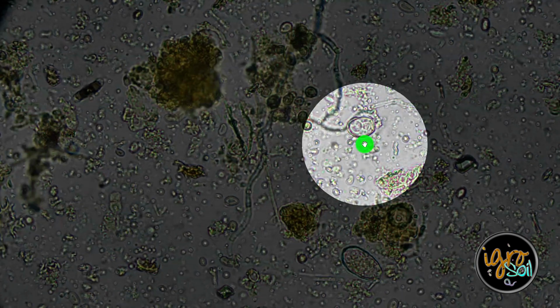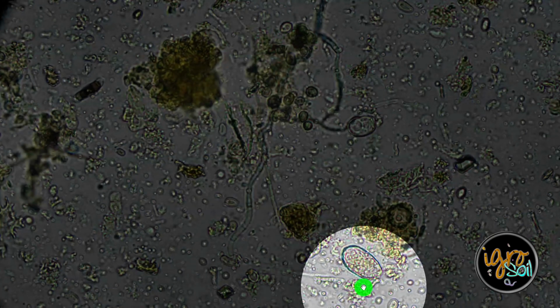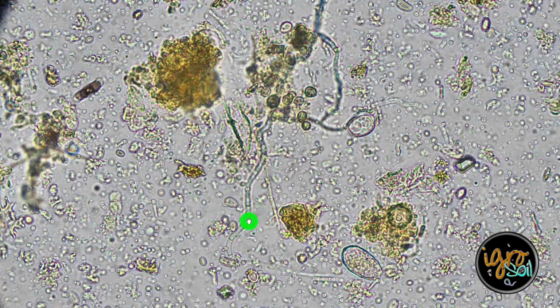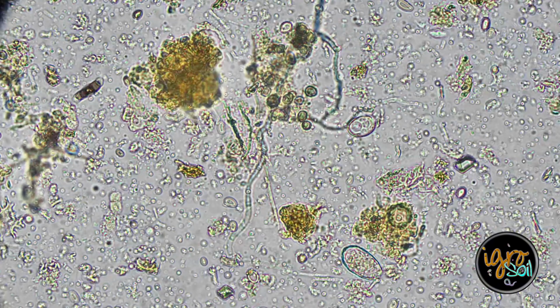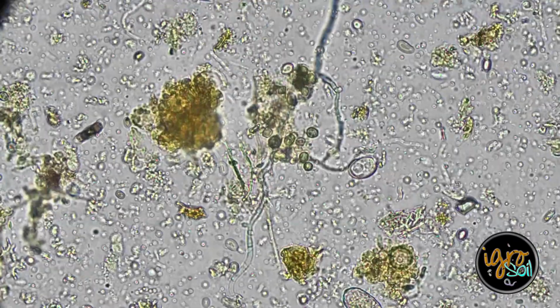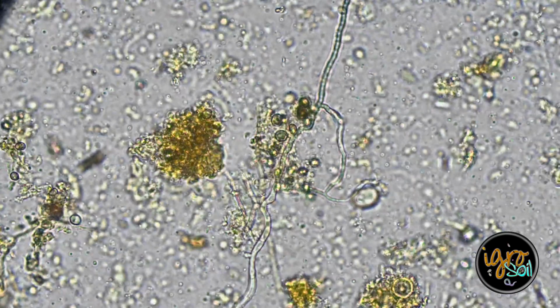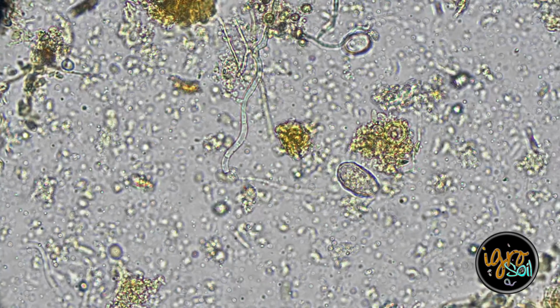Maybe a testate amoeba. Definitely a testate amoeba here. And then what's going on here? See these little clusters? I'm not sure what that is, but we're going to look at this strand. This might be hyphae, should be hyphae. Let's see if I can get a clearer shot on that. Maybe it's an actinomycete. That's tough.